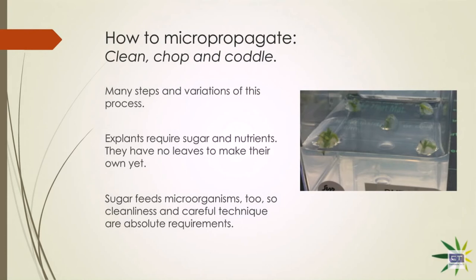Exactly. And the chemical composition of both of those gels in that picture are kept as similar as possible because they will be eventually anyway by diffusion there. Treat them gently, and if you do it right, you will see growth cracking out of those beads, sometimes honestly within 48 hours or less. Oh, wow. If you're doing it right and you have your conditions right, including the quality of your starting material, your growing conditions, and that does vary cultivar by cultivar, too. Some cultivars love being chopped up.